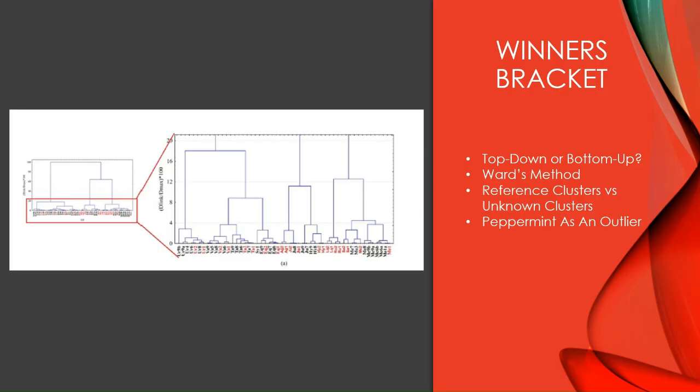For the purposes of this study, HCA was used to prove reference materials of known composition would be clustered with unknowns of the same composition, regardless of origin, and then spread across as it goes down. The hierarchy would separate into different regions. This was done successfully, with the exception of peppermint, as I mentioned earlier, which varied from references to form two different subclusters of 4.4. These over here are the different subclusters. You can see two different subclusters for peppermint here.